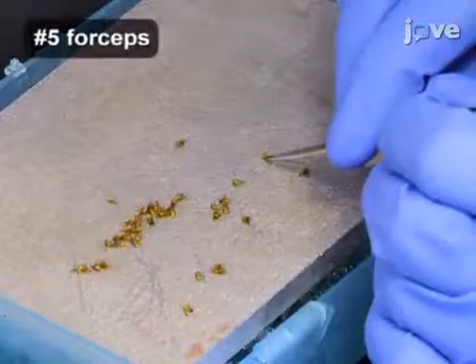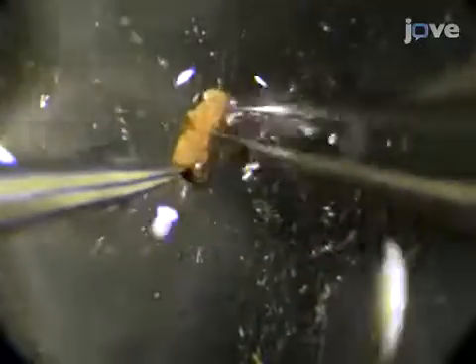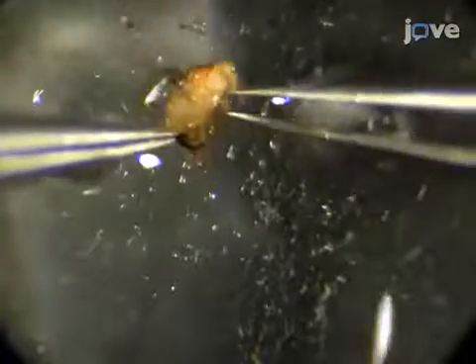Now, manipulate flies so that they are belly up and transfer one by the abdomen into the PTN. Completely submerge the animal in the PTN and perform the entire dissection submerged in PTN. With a second pair of forceps, grasp the proboscis.